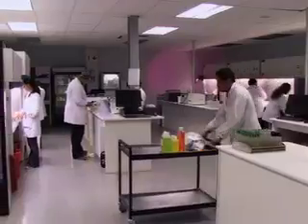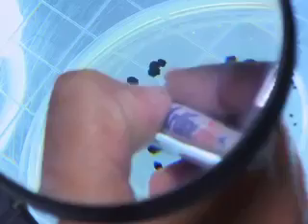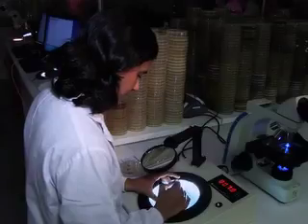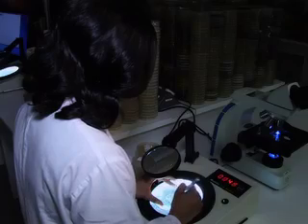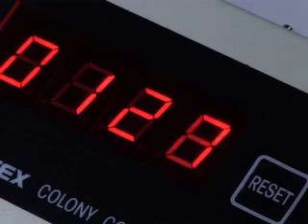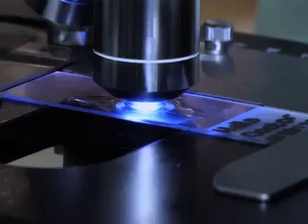Most bathrooms are home to a variety of bacteria. These include the relatively common staph and streptococcus, as well as E. coli and salmonella. Exposure to these bacteria can potentially cause serious infections. Once Dawn's samples arrive here, it's at the final stage where we'll be counting the bacterial cells of each and every sample. If we need to learn more about the bacteria, then we will do a microscopic investigation, and once we're done, we'll print results for the client.